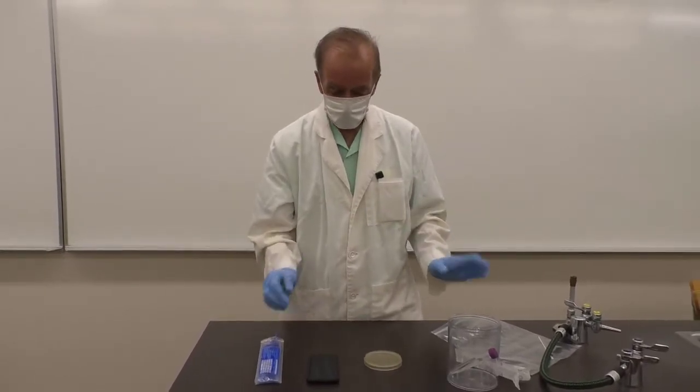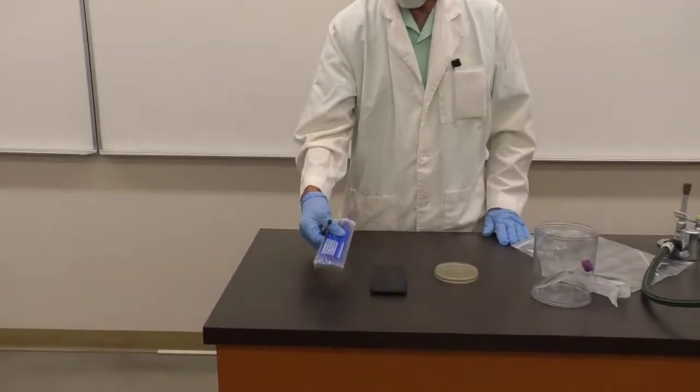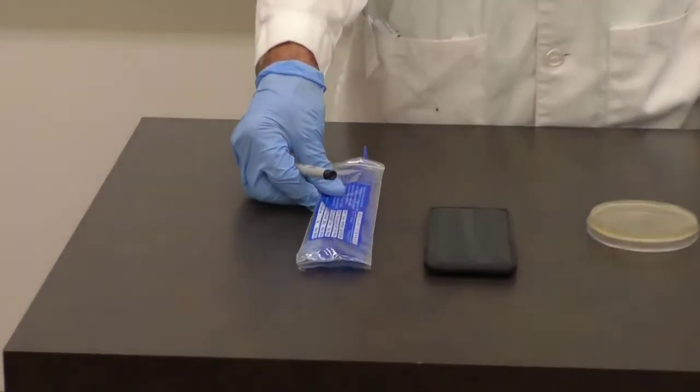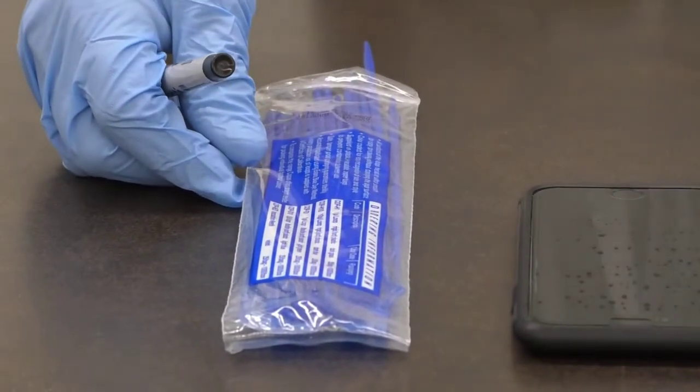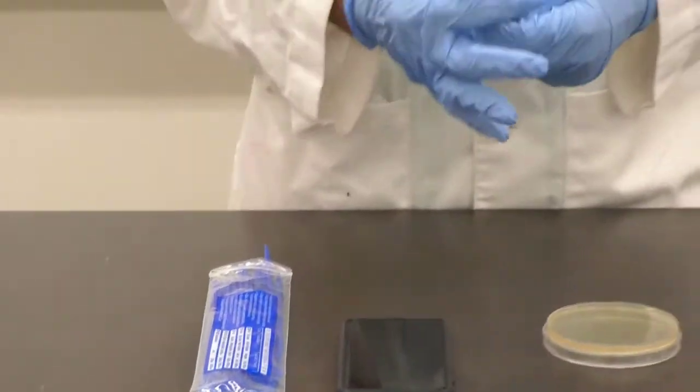Now, for making a streak plate from this, you have a package of 25 or so sterile inoculating loops. And unlike the metal inoculating loops, these loops, since they're plastic, can only be used once.